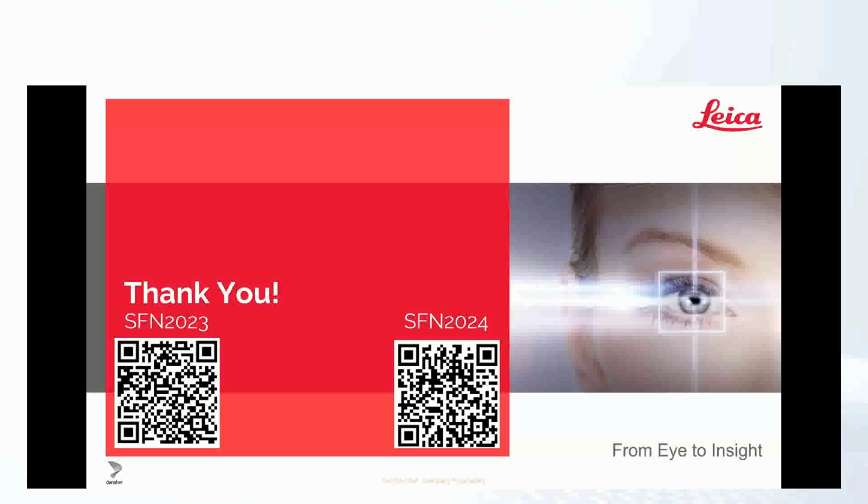So if I was going to tell you one slide, if I'm doing a size about my thumbnail, because that's kind of one of the sizes out there, about a square centimeter, one round would take about 3.7 hours of one slide. But if I was going to do 10 slides, it would only take 8 hours. So I could get 10 slides in the same amount of time.